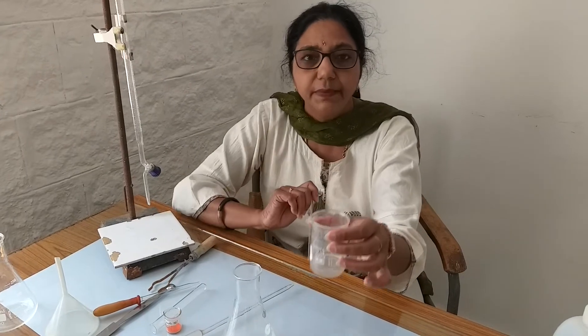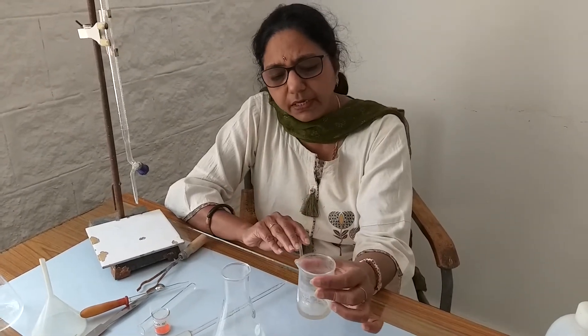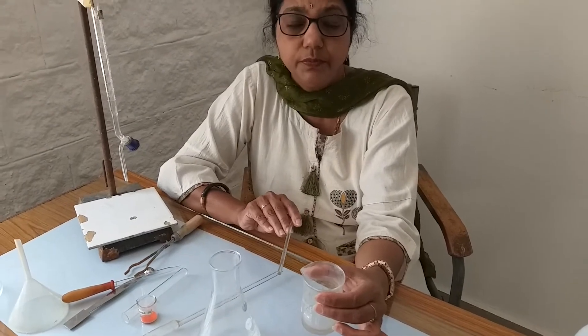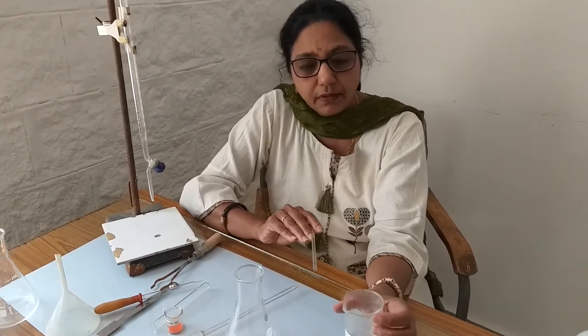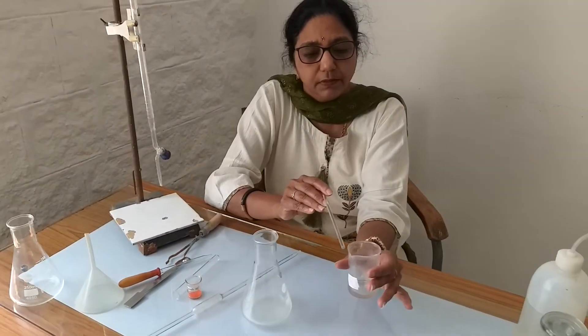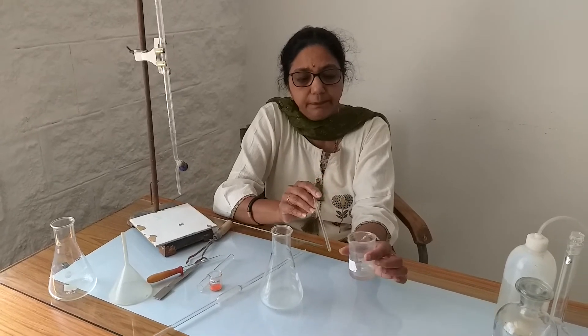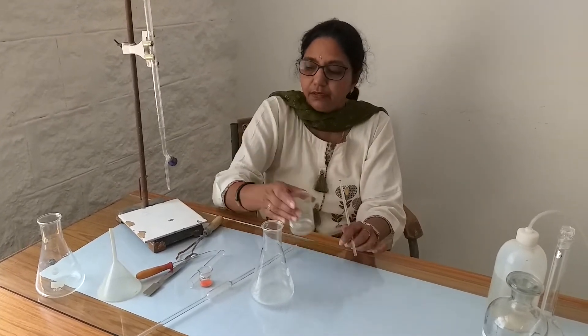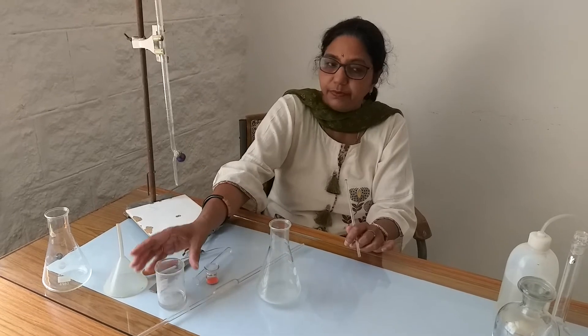This is the beaker. The beaker can range from 1 ml to many liters in capacity. Because the beaker has a small beak or a spout, we call it a beaker. It has a wide mouth, and we normally use these beakers to prepare solutions.